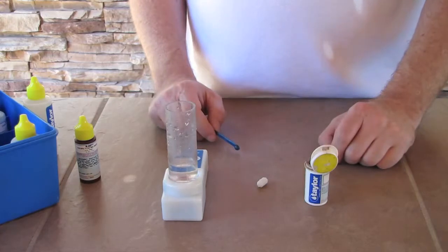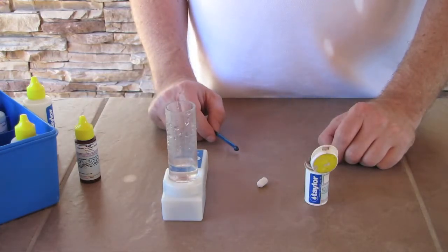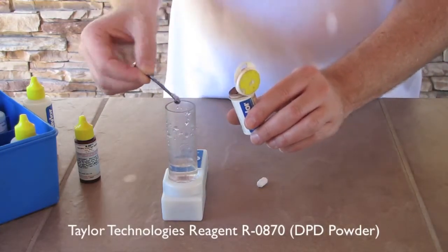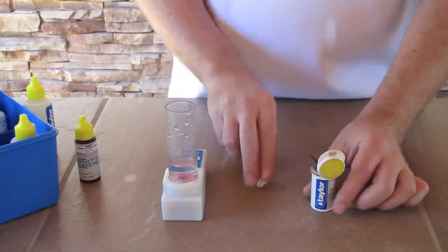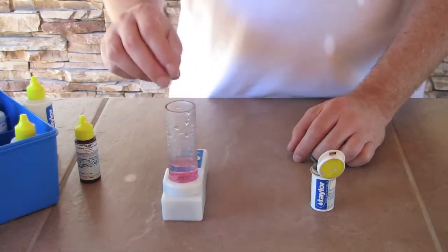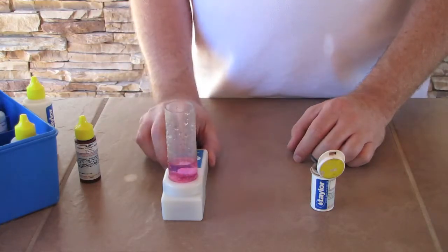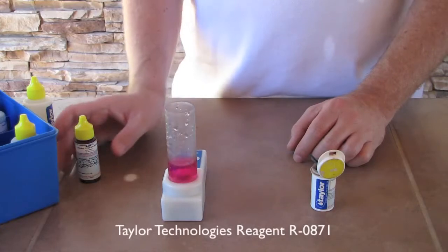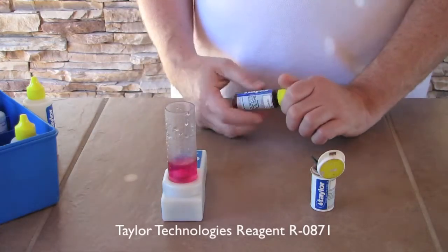We like to use the Taylor reagents and products, so we will be using their speed stir to help agitate. Ken's going to take and get a good scoop of the DPD powder, put it in there, and we see pink, which indicates we have chlorine. He'll drop in the agitating pill and turn the speed stir on, and the next step he'll do is grab the R0871 reagent.